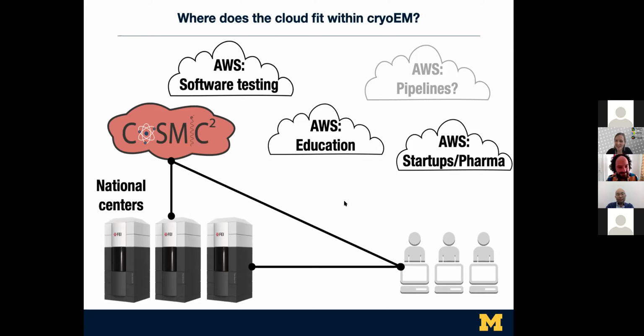Let's see. There's a question about the particular example of particle polishing with Warp on AWS. And have you run into IO quotas or problems handling corrected movies? I guess I did polishing and rely on the cloud.